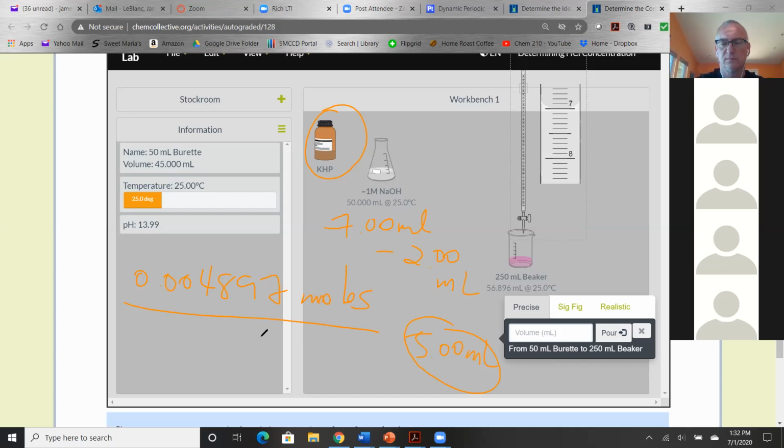1,000. So 5 mL is 1,000 liters? I mean, 0.005. Right, so I multiply that by 1 over 1,000. Right, that gives me 1 liter, 1,000 mL. So that's 0.00500 liters. That is my concentration of hydroxide. So what is it?